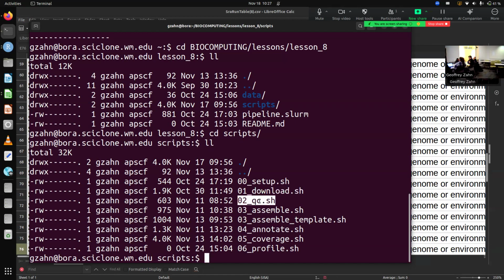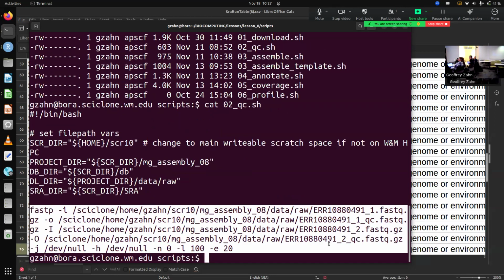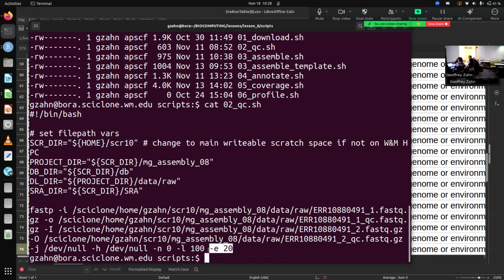We've got the quality control. There's the fastp. That one's going to have to be turned into a for loop. I don't know if you guys have that. That shouldn't be too troublesome, especially because we did that in the last assignment. So what am I doing here? This was the only real thing.